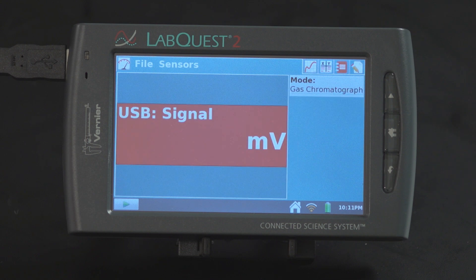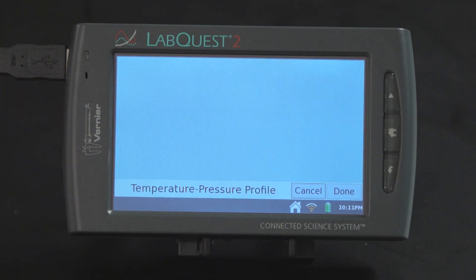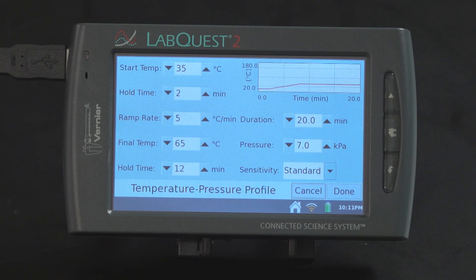Tap on Collect to bring up the temperature pressure profile. Depending on your sample, you may need to modify these parameters to obtain good separation. For this sample mixture, change the pressure to 4 kPa.